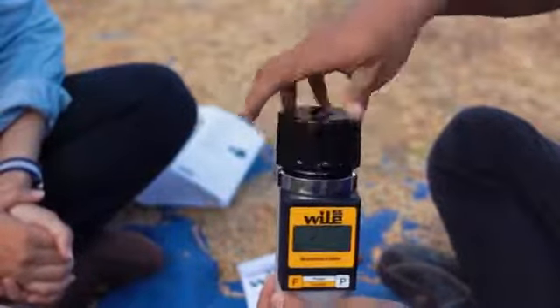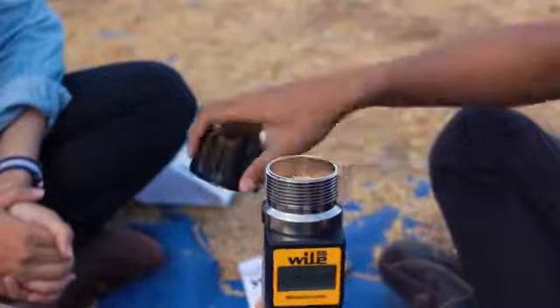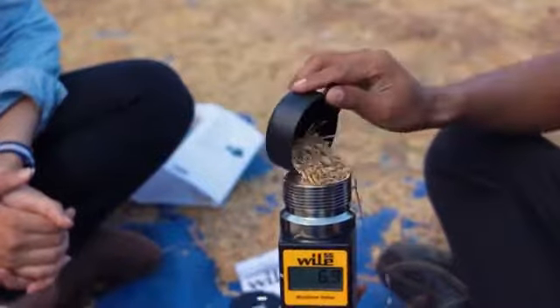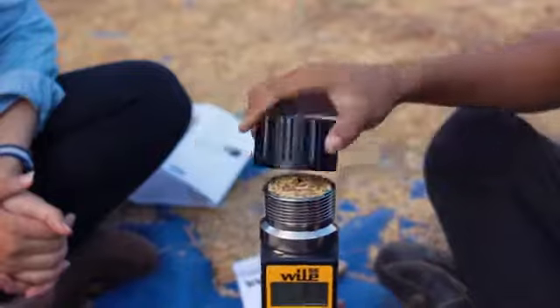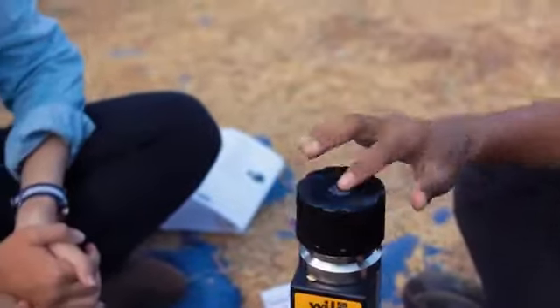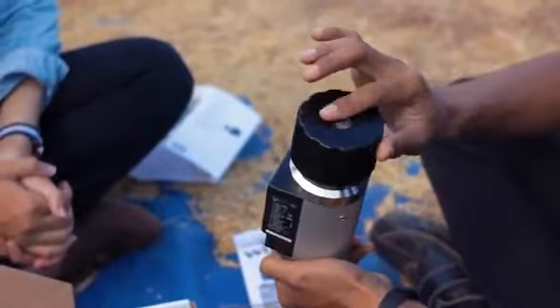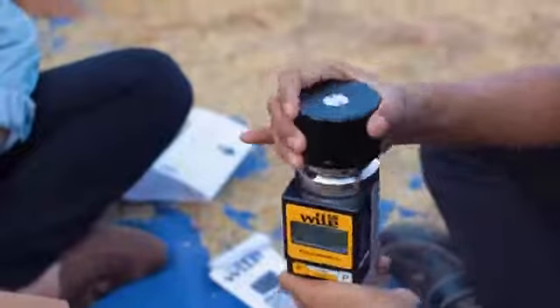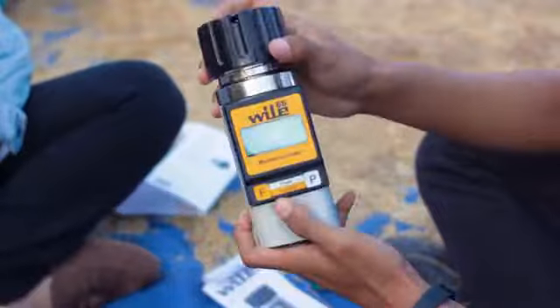Lalu goyangkan. Kemudian nyalakan alatnya. Kita masukkan lagi sampelnya hingga penuh. Kita tutup kembali. Untuk pengukuran, lihat pada titik tengah ini harus rata dengan titik hitam ini. Jika sudah rata, kemudian kita nyalakan alatnya.